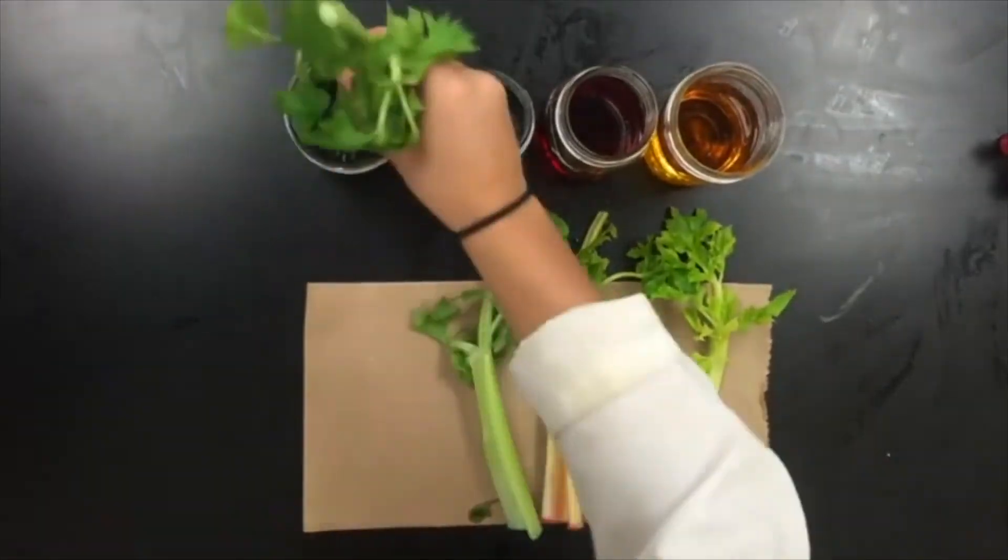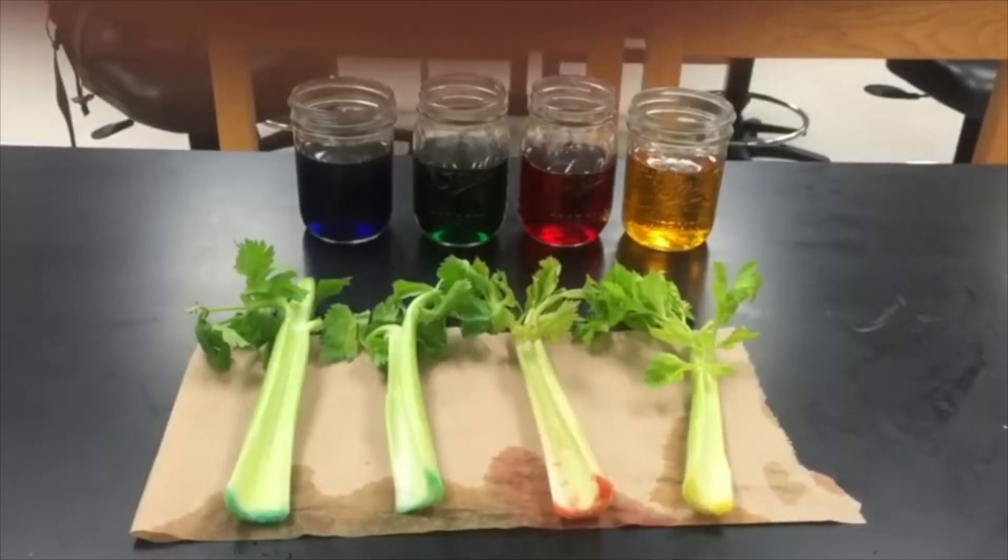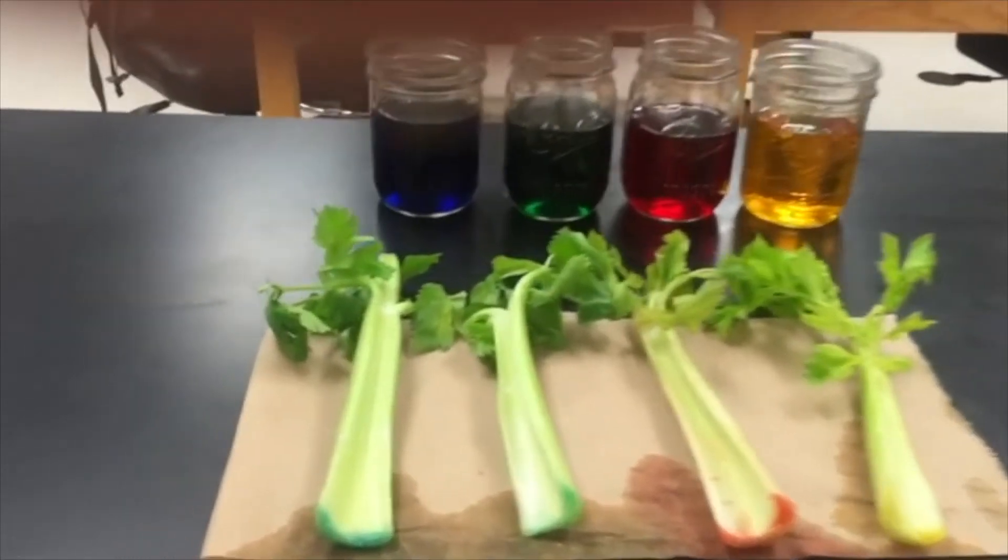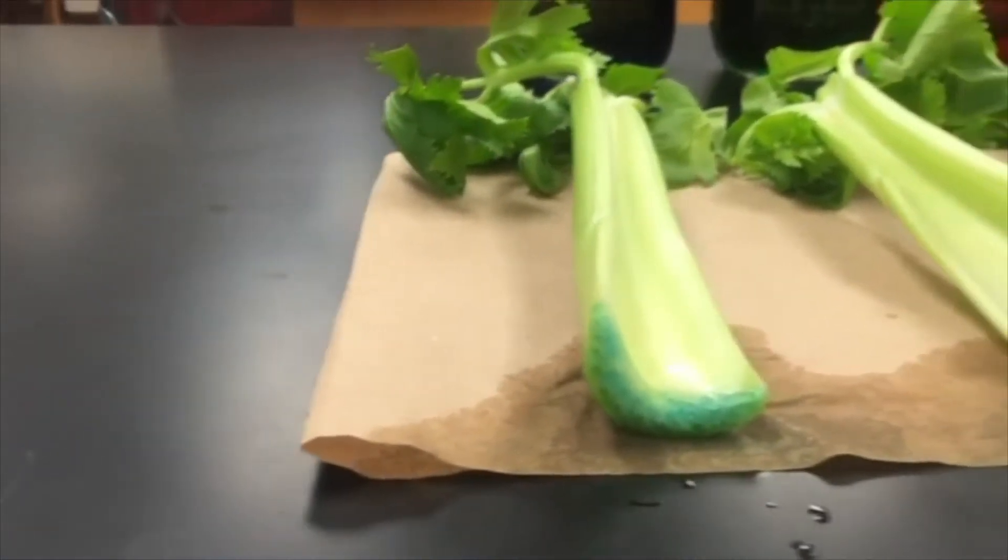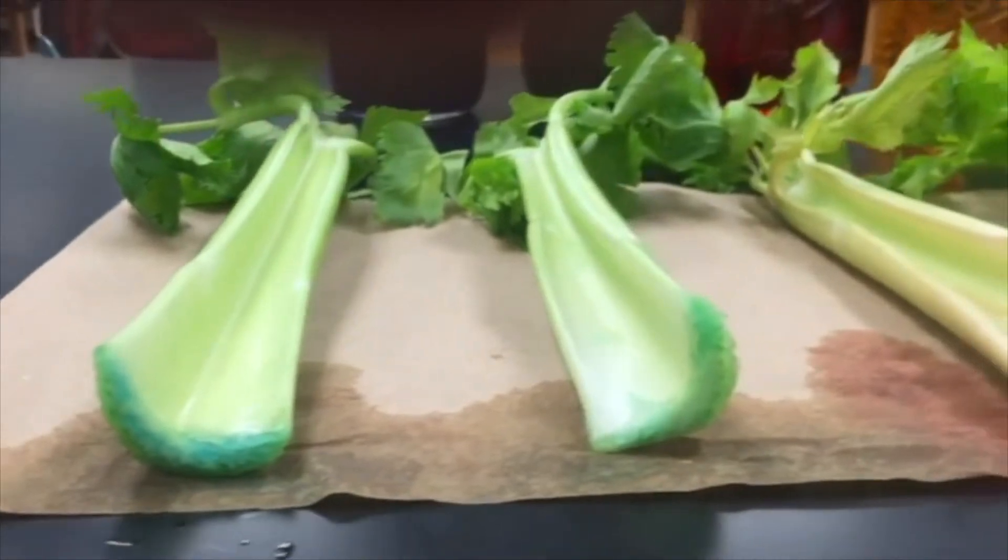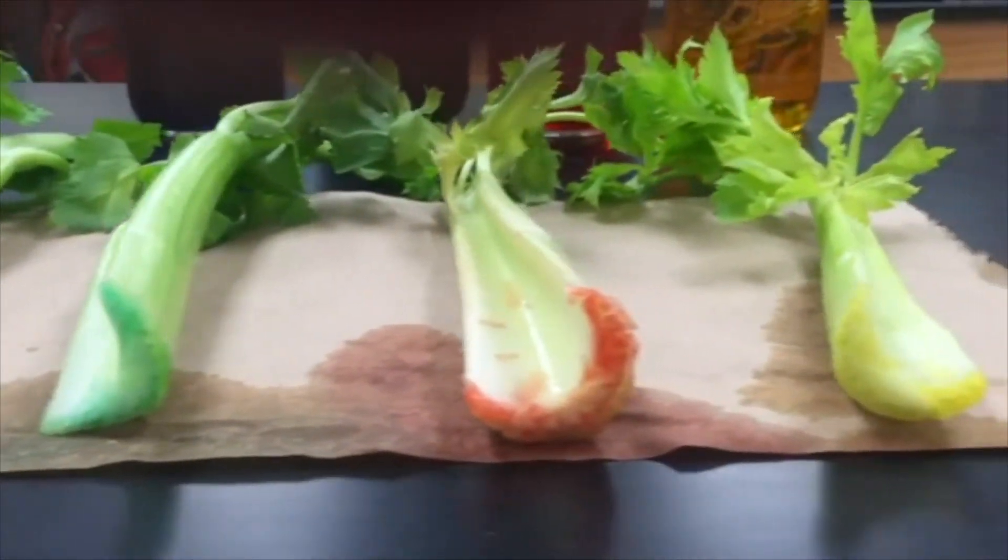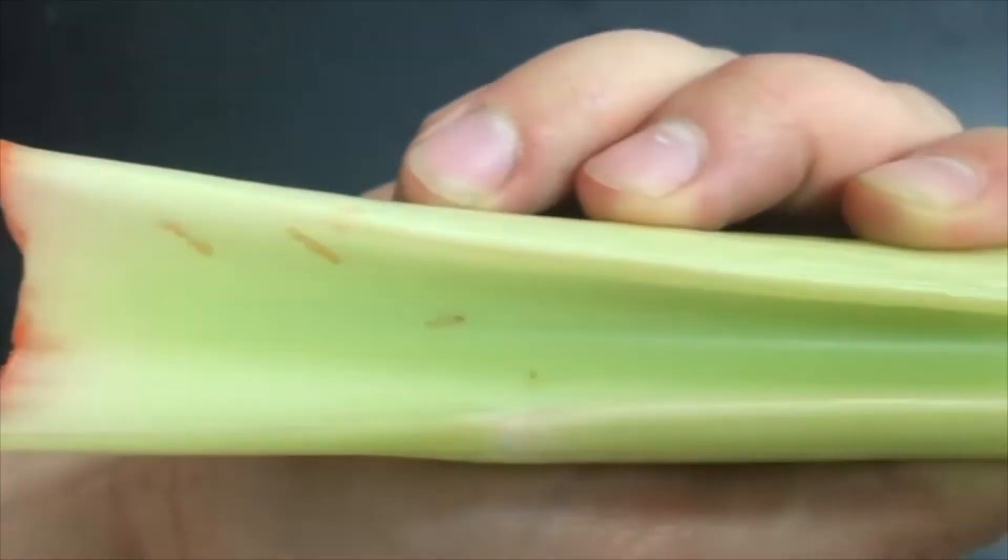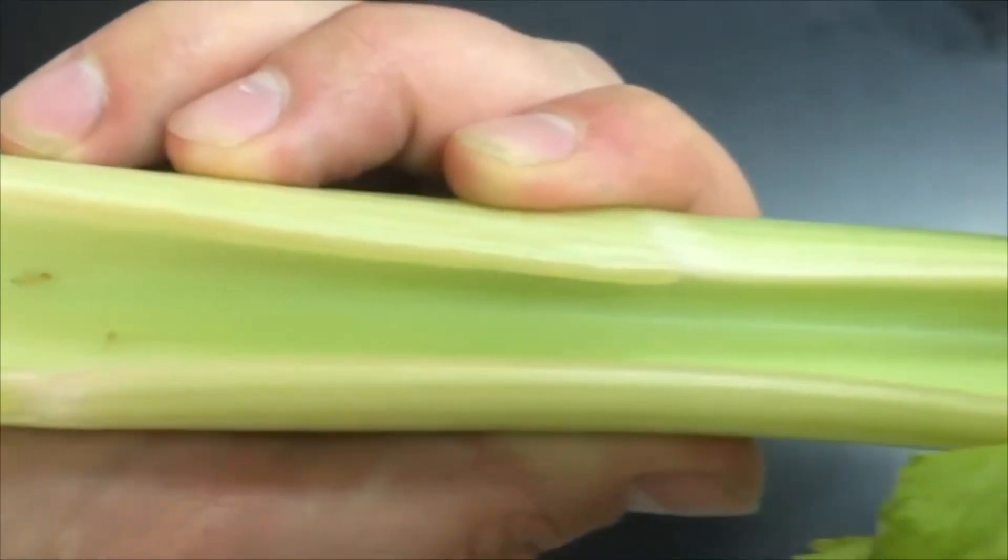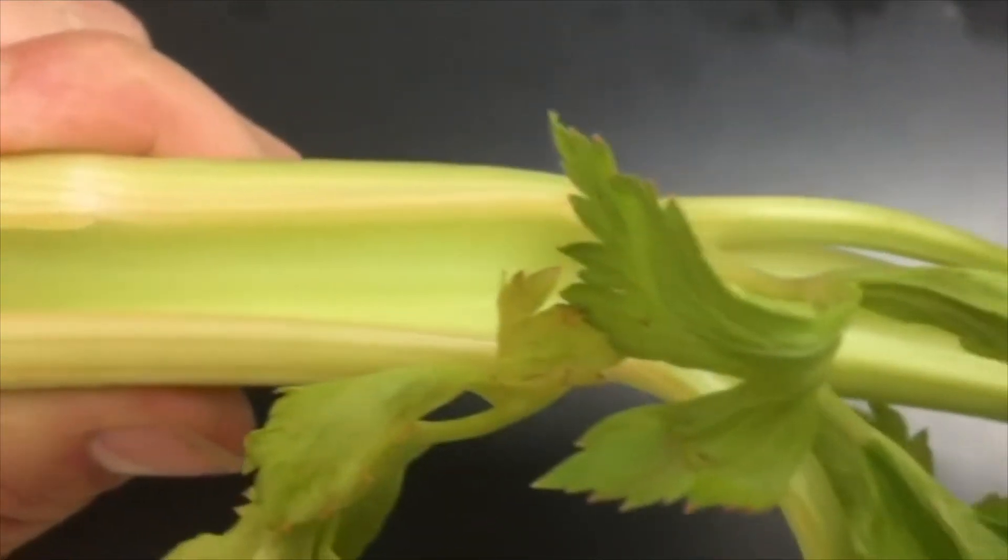Once the time is up you can remove them from the dye and take a look at the bottoms. You'll be able to see that the food coloring has moved into the celery stalks. In fact you'll be able to see clearly that the food coloring has moved up the celery stalks and into the leaves.